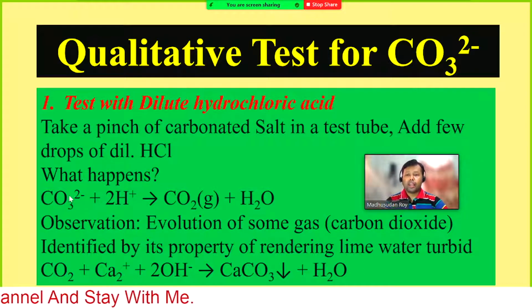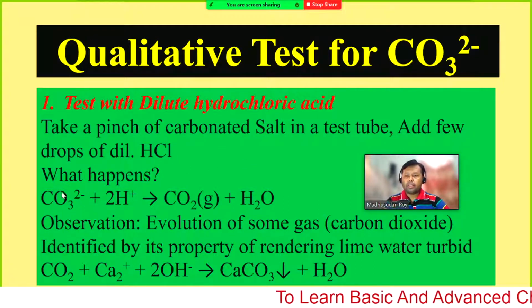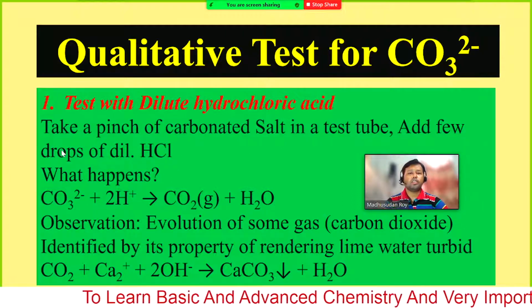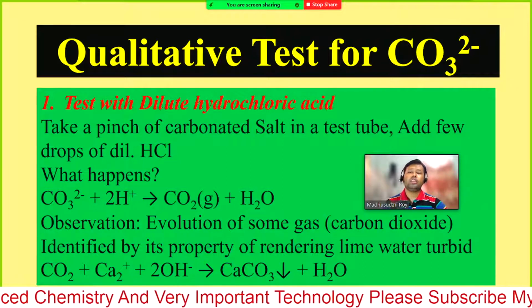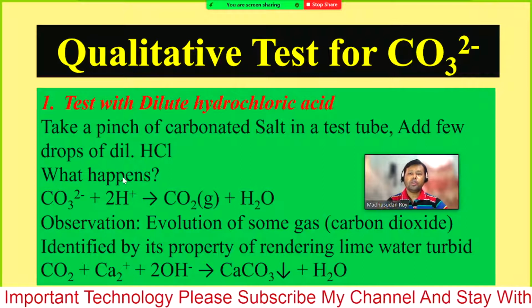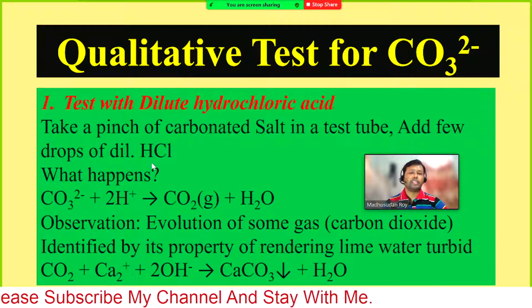So take some carbonate salt in a test tube and add a few drops of dilute hydrochloric acid. The salt you don't need to dissolve in water. Just take the solid salt, which can be crystals or powder or whatever, and add dilute hydrochloric acid.